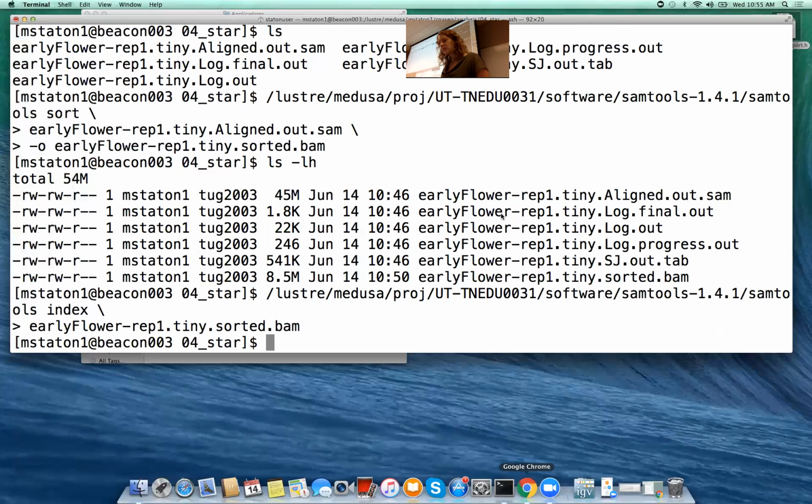Now, what we actually are interested in are RNA-seq data, right? Like, where are my reads? So I'm going to load from file and go get the BAM file. It says zoom in to see alignments. We have so many reads, I can't even show them at this scale. So let's zoom in maybe on this one kind of big gene.